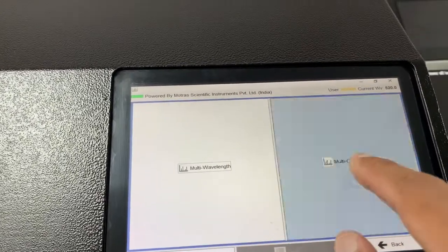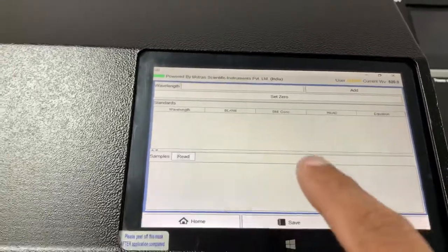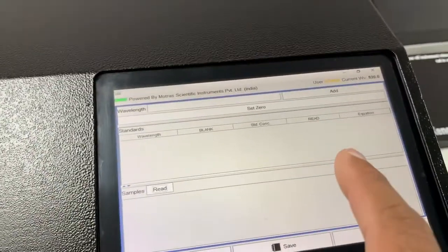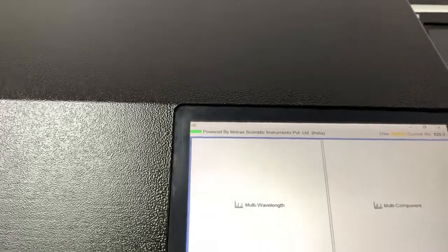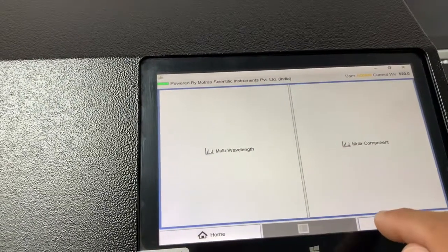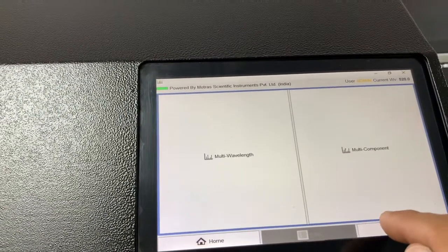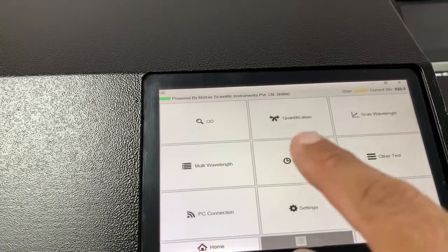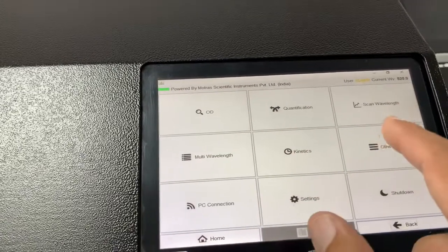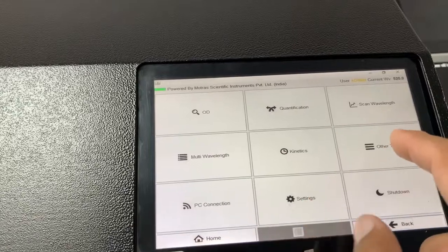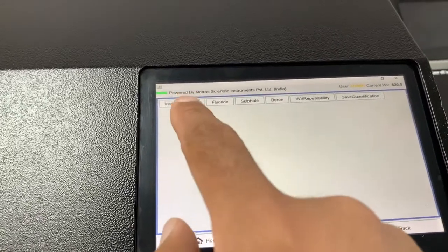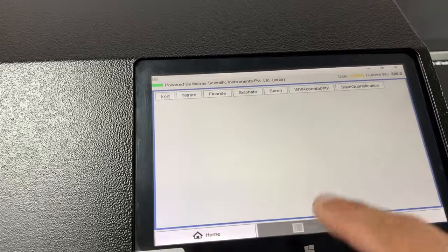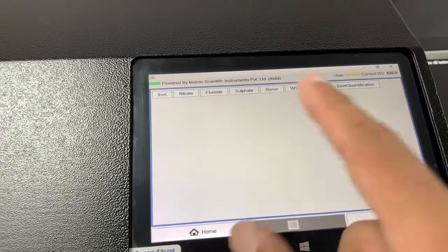We have multi-component mode as well. In multi-component mode, it's a two-point calibration, but you can have multiple components within the samples and it will use individual calibration curves for each standard and the samples. We also have functionality for other tests — these are internet-downloadable tests and we can customize tests for you as well, free of charge.